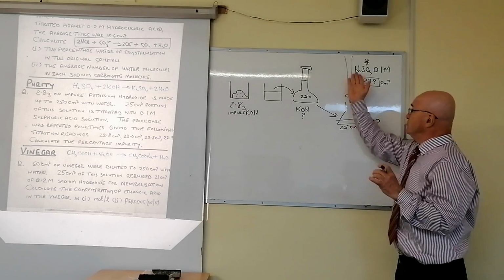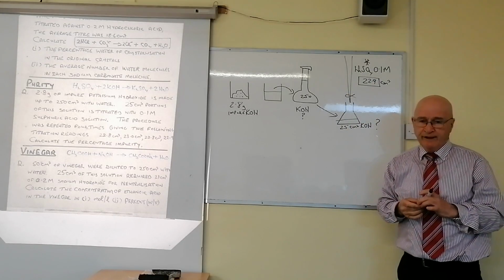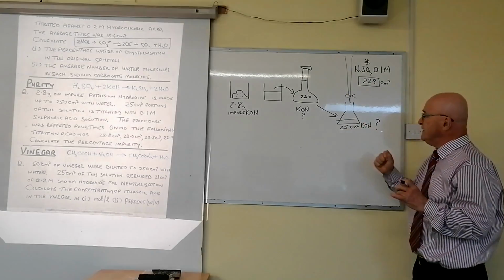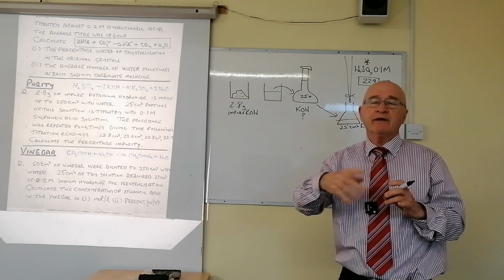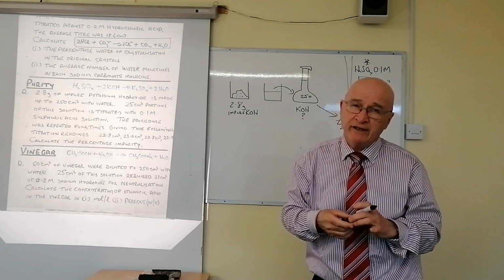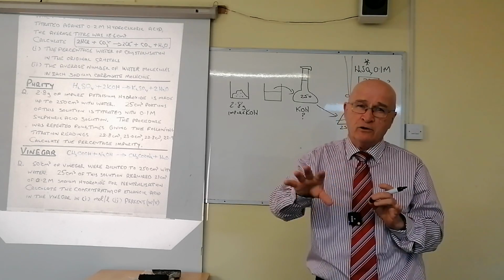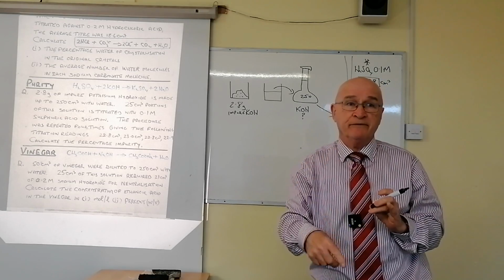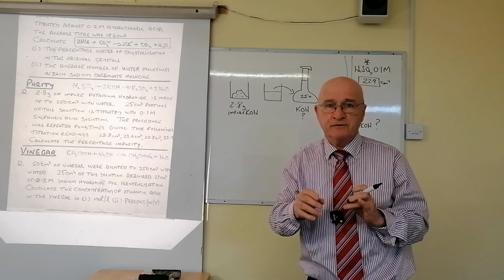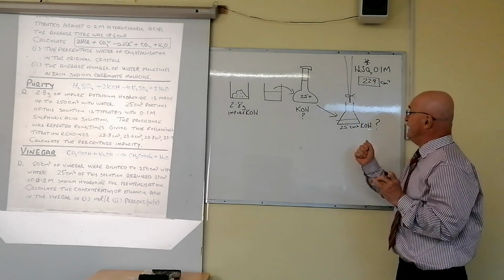And finally, how would you run a titration? Do you know that? The salient points are: open the tap and swirl the conical flask. You swirl it because you're going to be getting a temporary color change, and when you swirl it, the color goes. So by swirling it, you'll find out when the color change becomes permanent. And that's what you're after, right? The first permanent color change there.